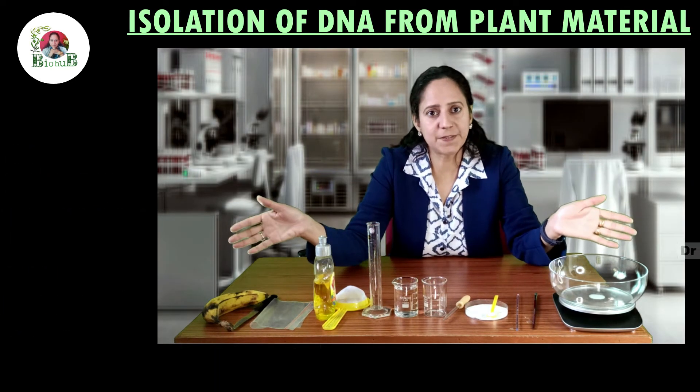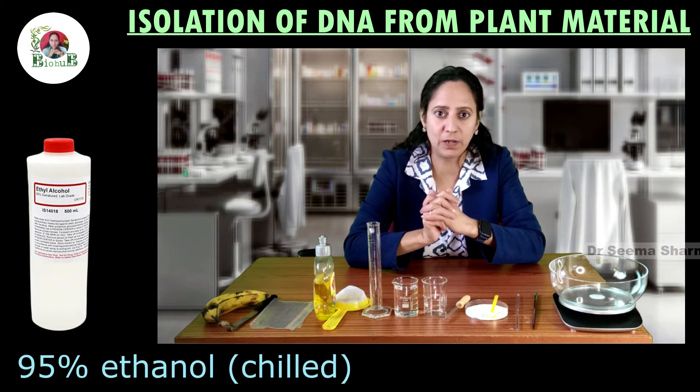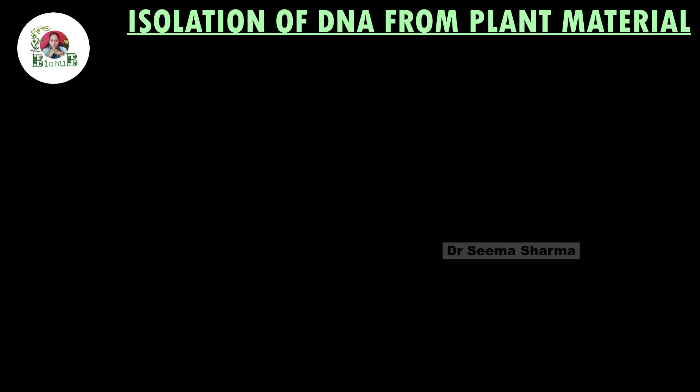In addition to these things, we also need 95% chilled ethanol. I have kept that bottle in the refrigerator and it will be taken out as and when required.